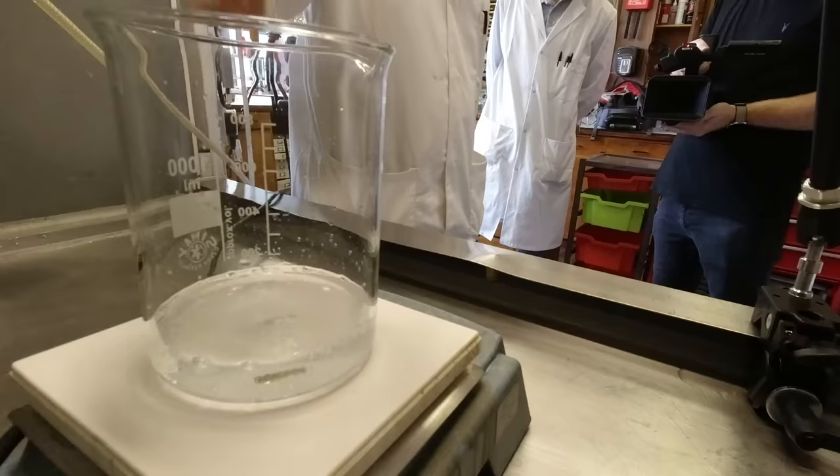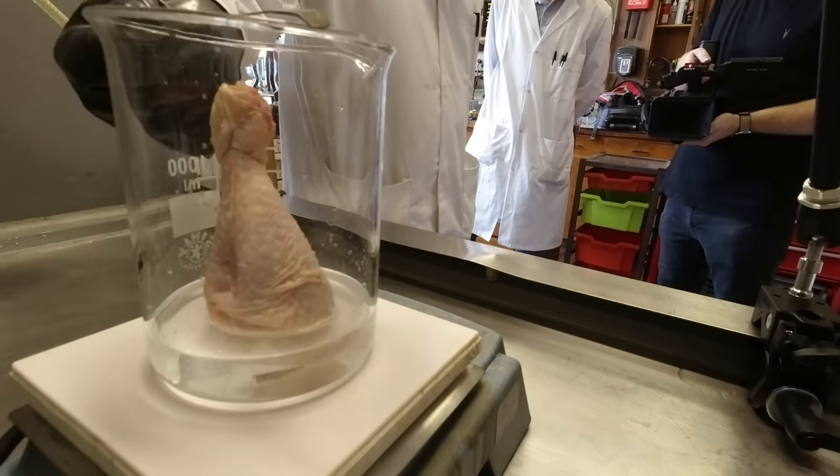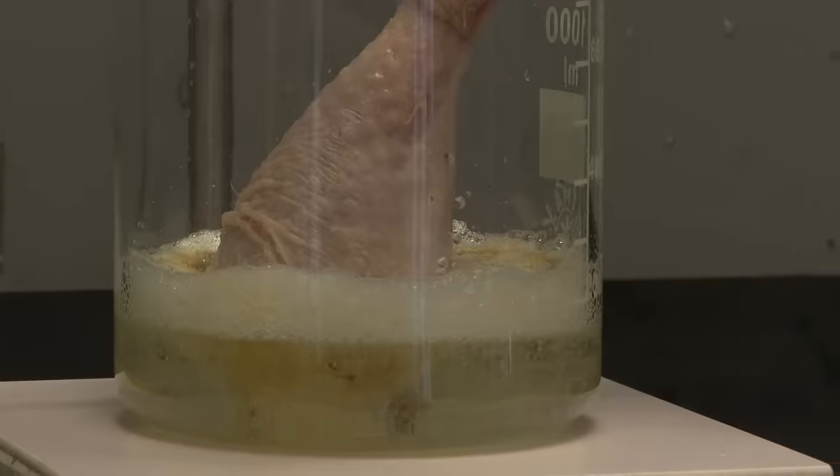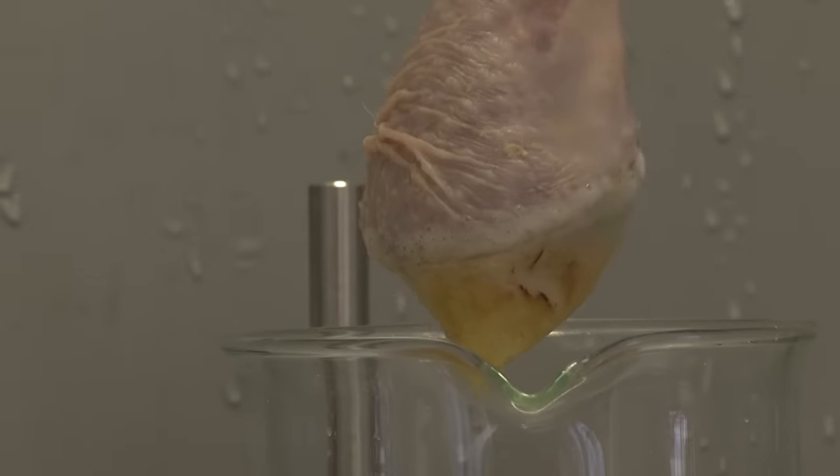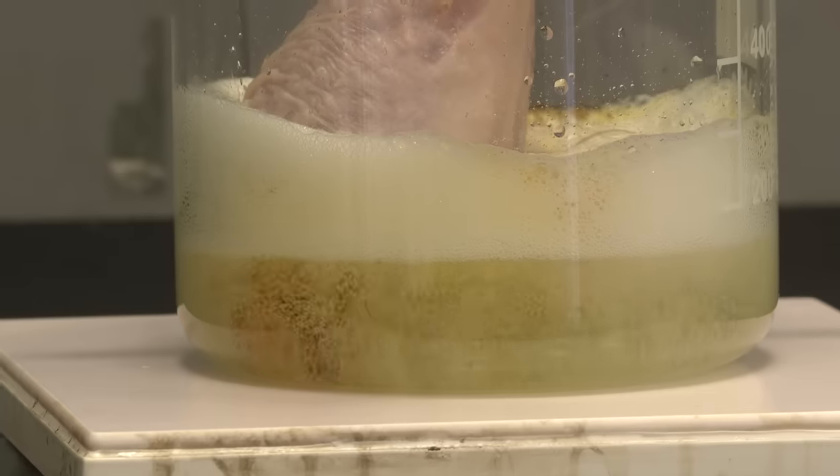Initially, Neil dangled the chicken leg into the Piranha Solution. Meat that was submerged dissolved quite quickly, again producing some carbon because meat is an organic compound, contains carbon, but not as much water as vegetable matter.